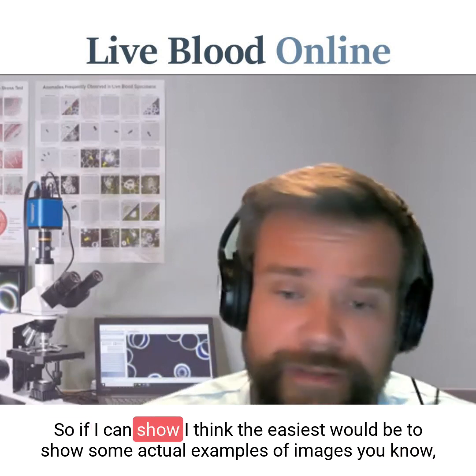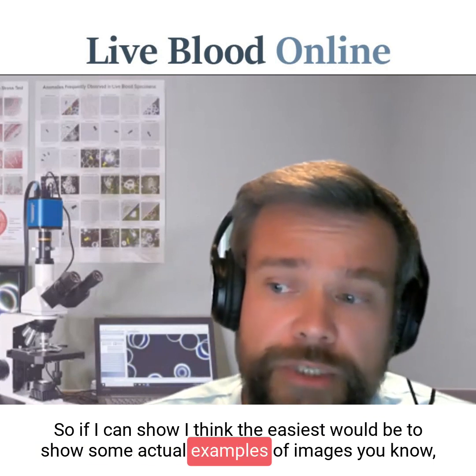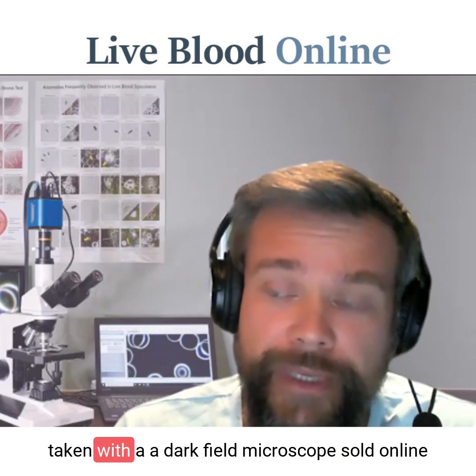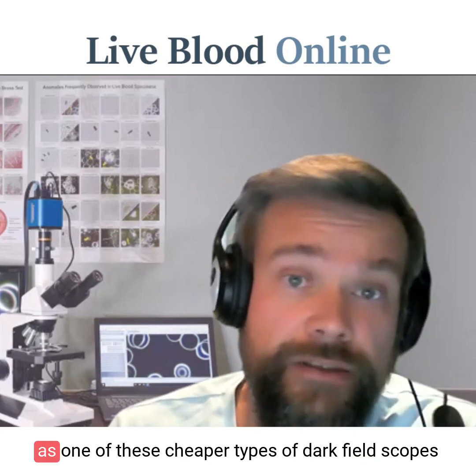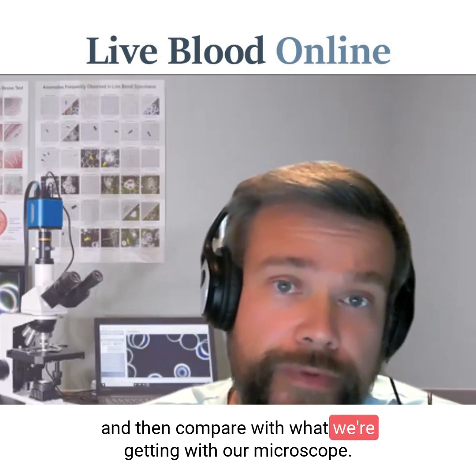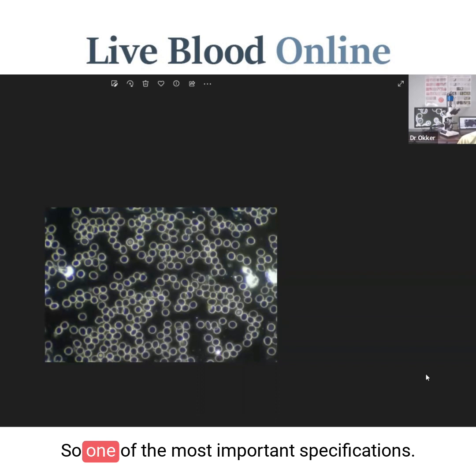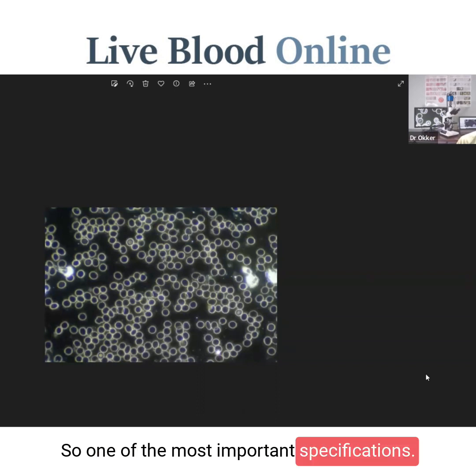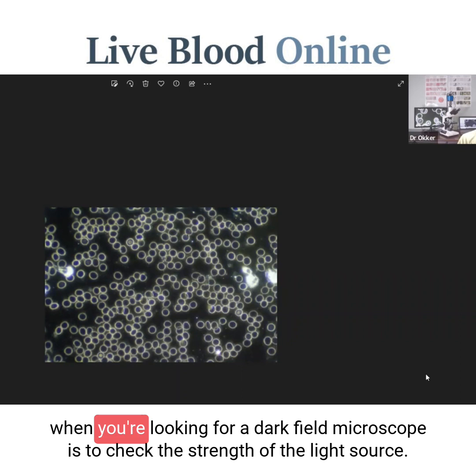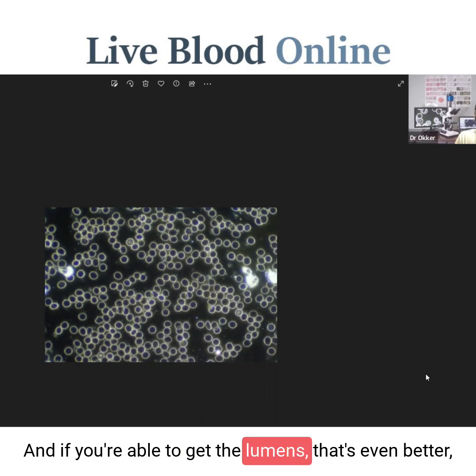I think the easiest would be to show some actual examples of images taken with a dark field microscope sold online as one of these cheaper types, and then compare with what we're getting with our microscope. These specifications are really important. One of the most important, and the first thing to check when you're looking for a dark field microscope, is to check the strength of the light source — the specific wattage, and if you're able to get the lumens, that's even better.